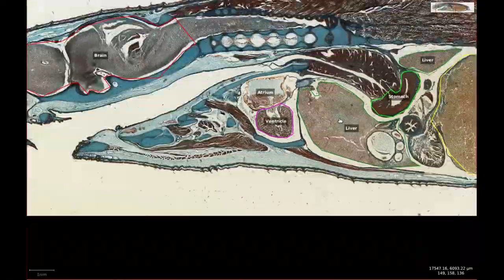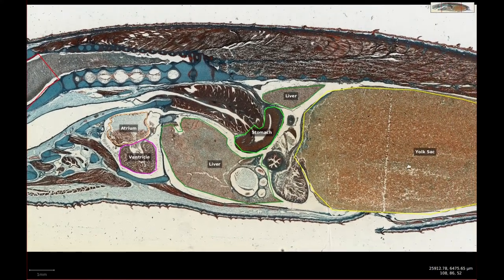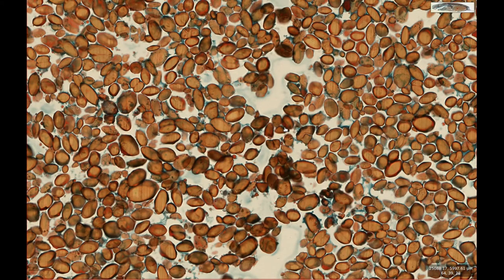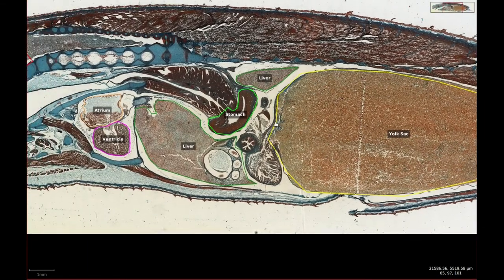Also in the coelomic cavity, we have a few round sections of intestine, but the dominating organ is this huge oval sac filled with yellowish globules. You might be tempted to identify these as red blood cells, but look a bit more closely and you'll see that they're not nucleated as red blood cells should be.